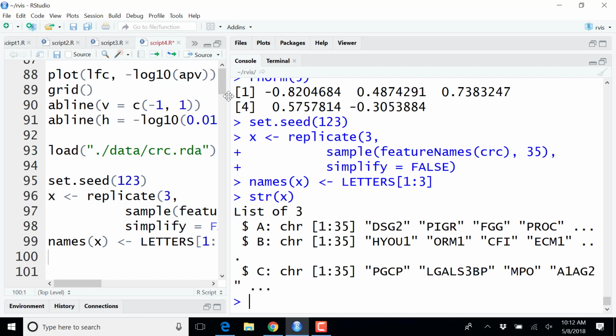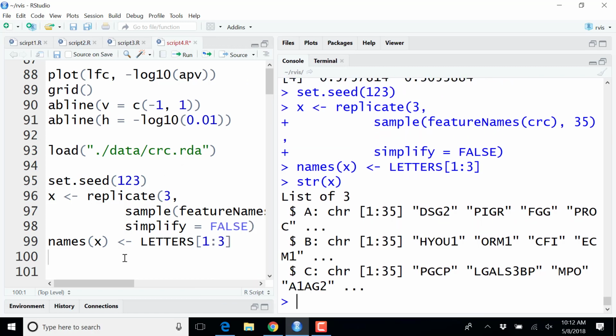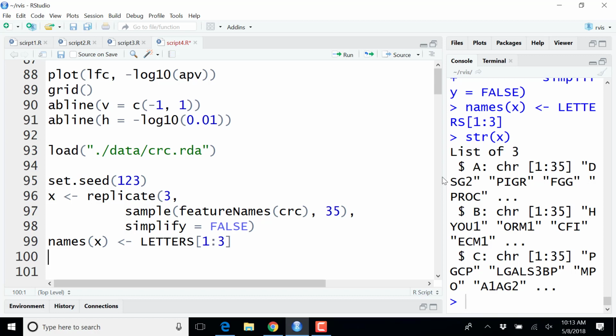One package that, and the typical way we do this. Opening it up a little. Oh, yes, okay. Behind it, I can't. Sorry. I'll give you a couple of minutes to.